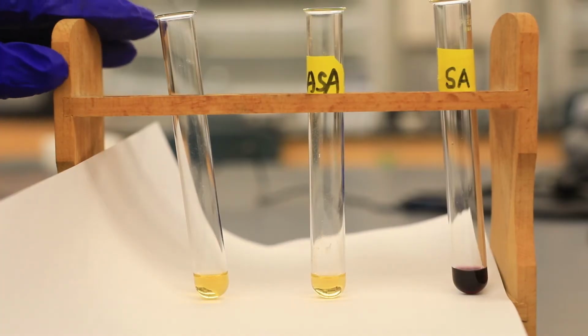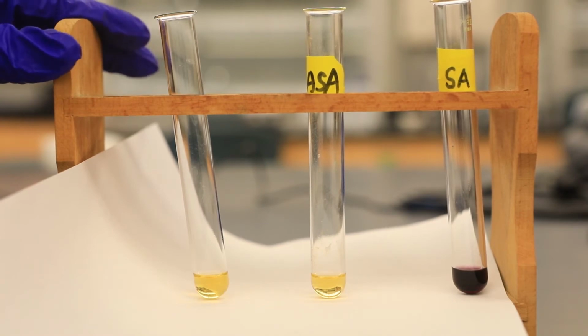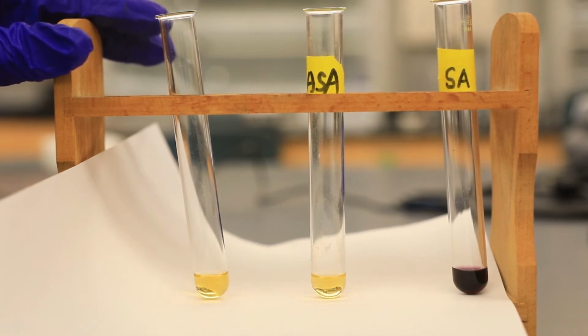So in this part of the experiment, we're going to be testing for purity to see if we have any unreacted salicylic acid as a byproduct. And so if you recall, we said earlier that phenolic compounds in the presence of iron form a deep purple color. It doesn't have to be deep purple, but it forms a really dark color.